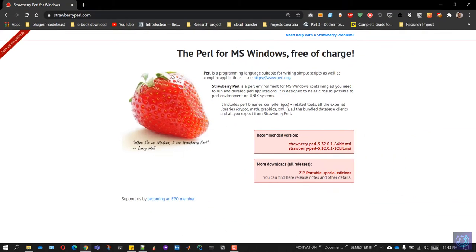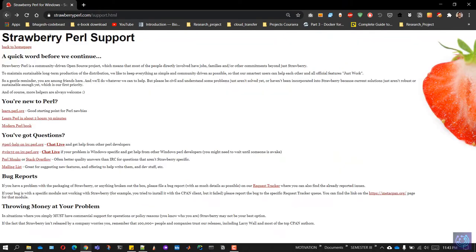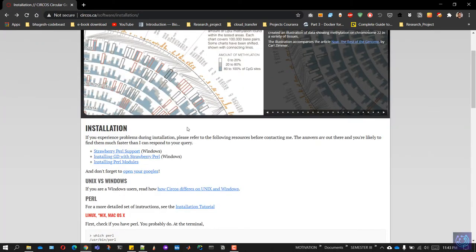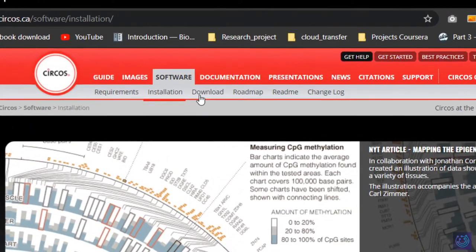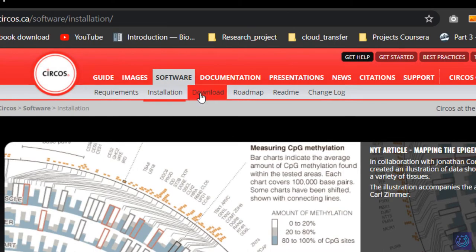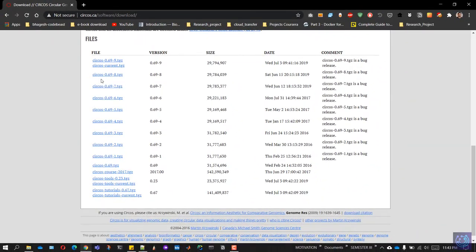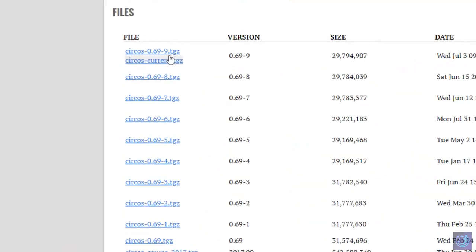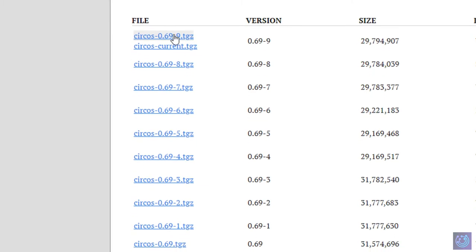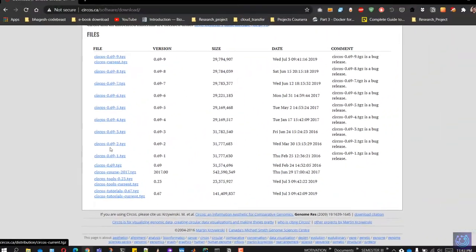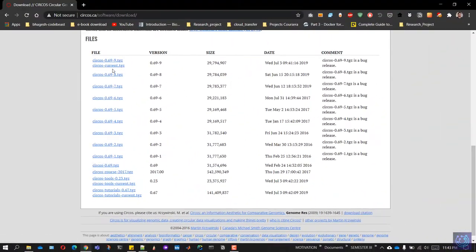Once you have installed Perl, go back to the Circos website and go to the download section in the same software tab. Scroll down until you see the version files of Circos. You'll have to download Circos current dot TGZ, which constitutes the current version of Circos, and Circos tutorials current dot TGZ, which has the tutorials for this current version.